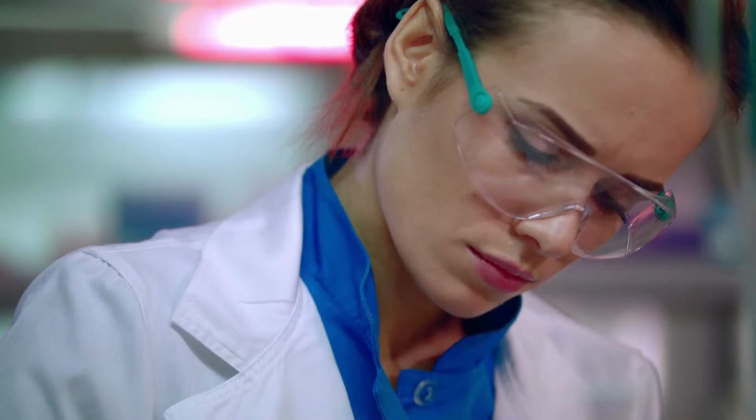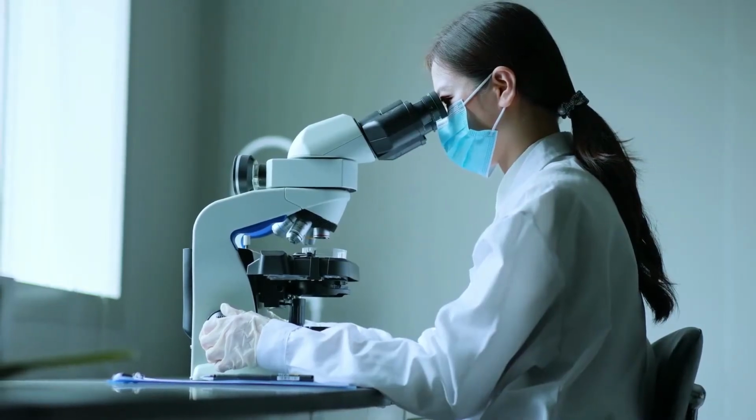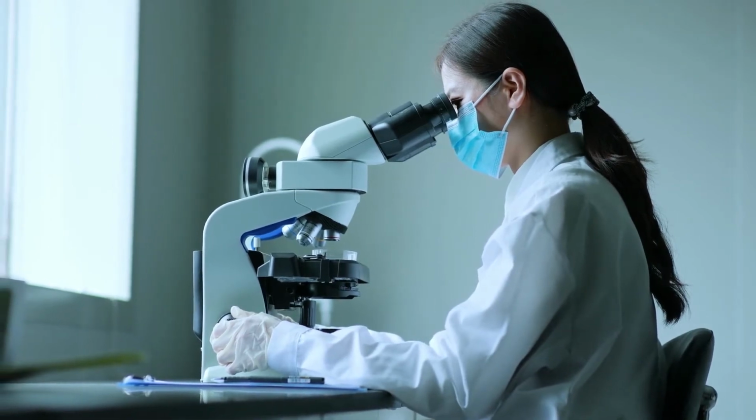The process of staining the flagella is very tedious. Also, it is very difficult to observe in the normal compound microscope. Bacterial movement must be distinguishable from Brownian movement.